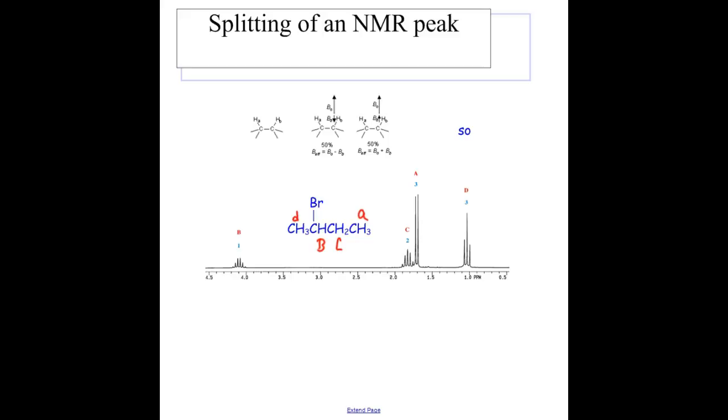So let's take a look at splitting. First, my B hydrogen is split, if we enlarge this, into 1, 2, 3, 4, 5, 6 little peaklets. And if we look at my B hydrogen, which I'm going to color yellow, it has 1, 2, 3, 4, 5 near neighbors.